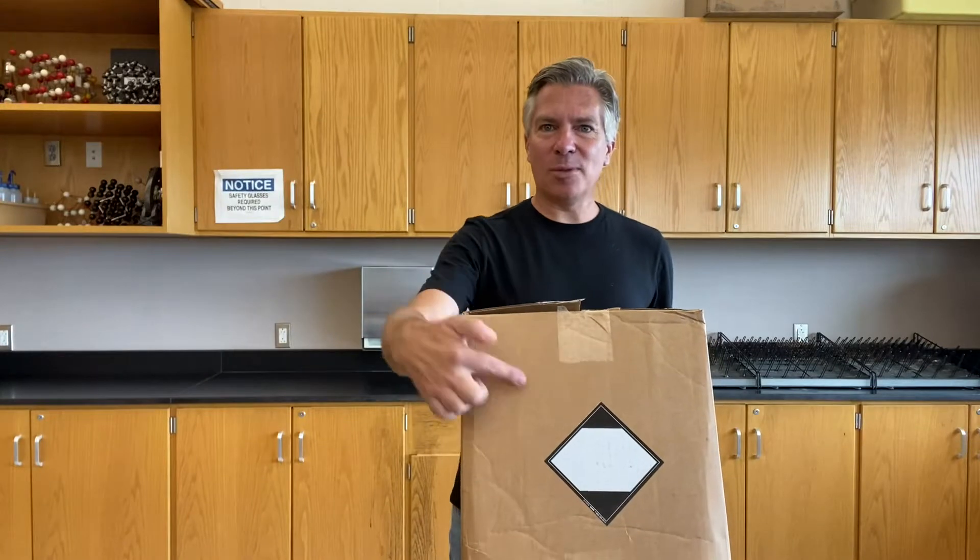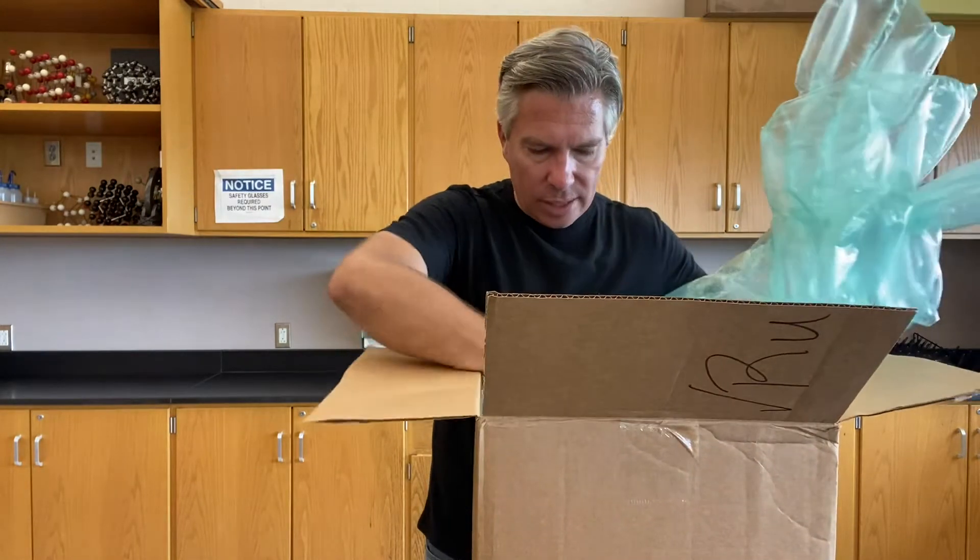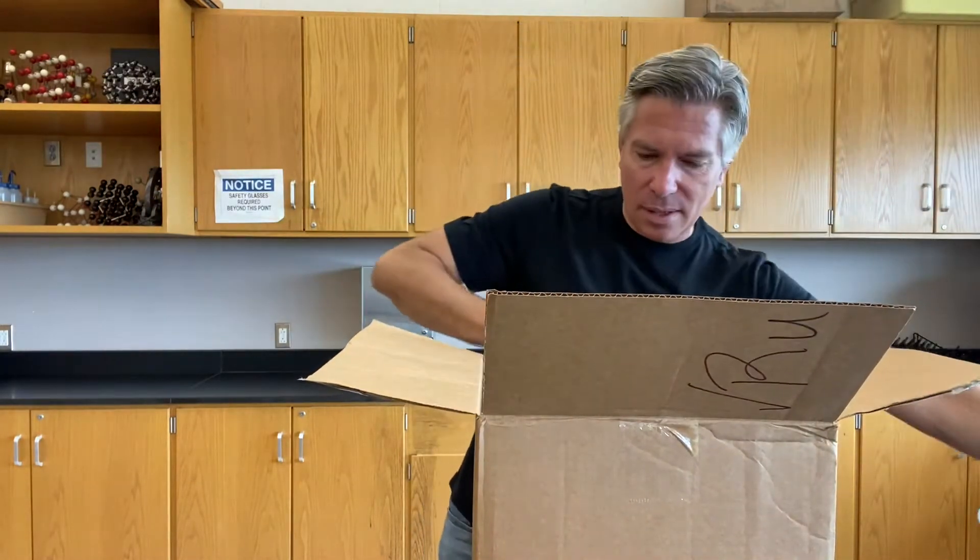This box comes with a big sticker on the side — that diamond-shaped sticker that we use in chemistry to denote that there's chemicals. So we're getting to some of the good stuff here and I'm very excited to see what kind of chemicals we ended up getting. There's definitely some chemicals in here.